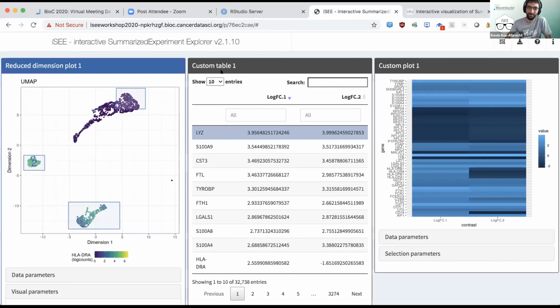There's a question on changing the color scales, which you can do, and there is a vignette on that. Yeah, there is a vignette. So look for something called the experiment color map. You can literally overwrite individual covariates, or individual assays. If you say, oh, I want my top hat counts to be colored from blue to red, going through white, and I want my log counts to go through the Viridis color scale, you can actually fine-tune every single covariate in your data set.